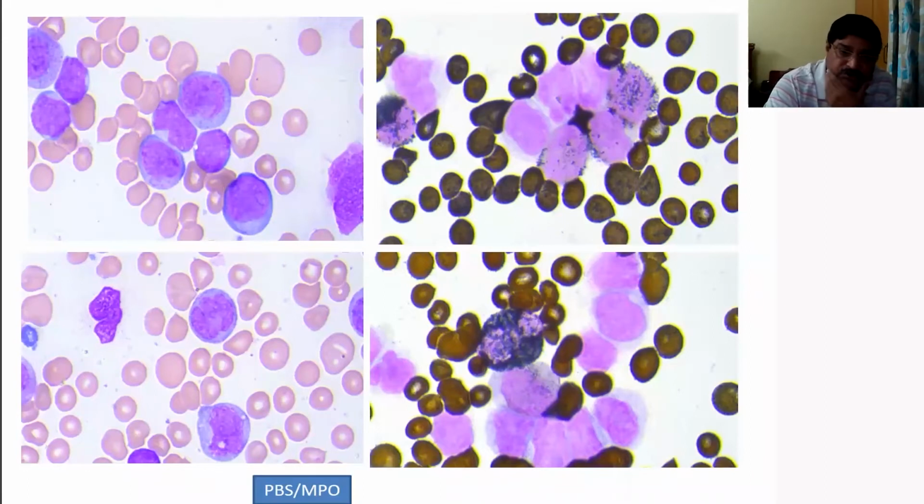If you do a flow cytometry in acute promyelocytic leukemia, you will have certain characteristic flow cytometric features. They are CD34 negative, CD117 positive, and HLA-DR negative. So you can label them as possible APML, and advise cytogenetics for 15;17.